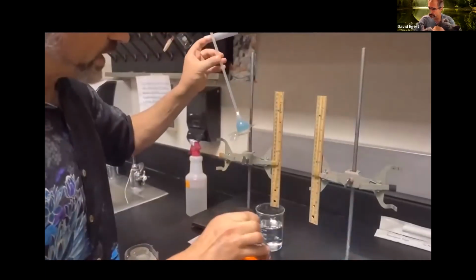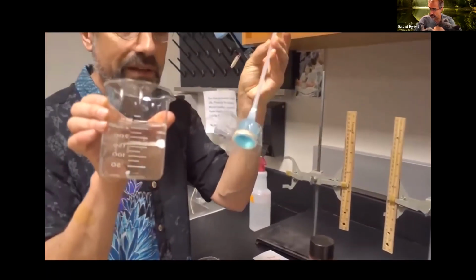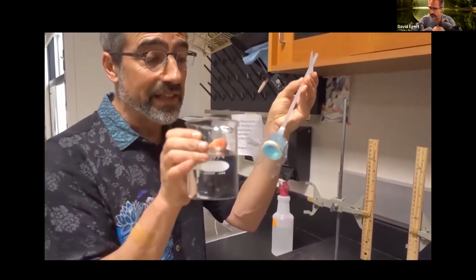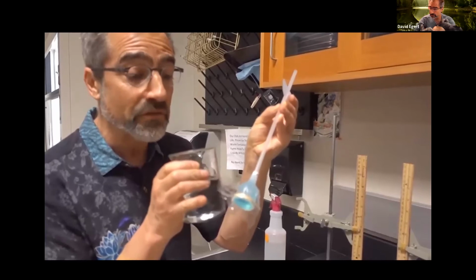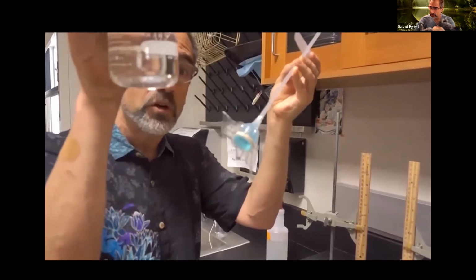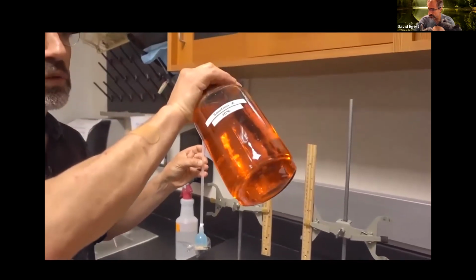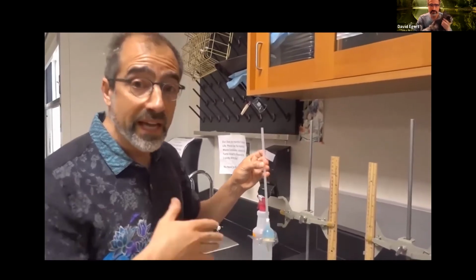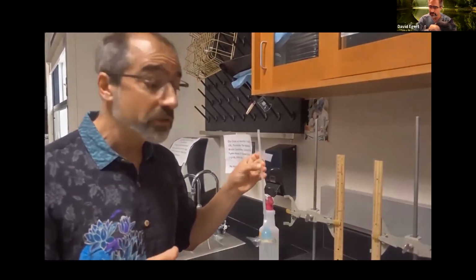So again, in this case, we have 40% inside and distilled water in our beaker. So, again, our independent variable here, what's changing? In this case, the thing that's driving osmosis is diffusion, the concentration gradient, the concentration difference across the two sides of the membrane. Here it's 40% in the funnel, 0 because it's distilled water in the beaker. The other group, where they fill with this 20% solution, have a different concentration gradient across the membrane. And we'll see how having a different concentration gradient across the membrane affects the rate of osmosis.